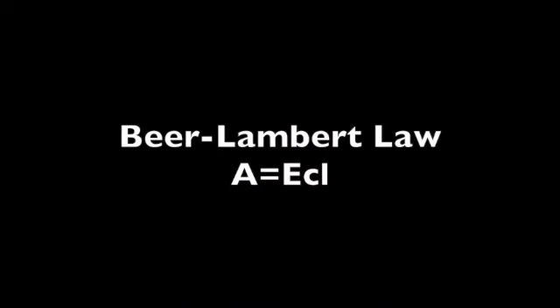Beer-Lambert's law defines a linear relationship between absorption and concentration. The linear relationship is set into the equation A equals ECl, where A represents absorption, E represents molar absorption coefficient, C represents molar concentration, and L represents optical path length.